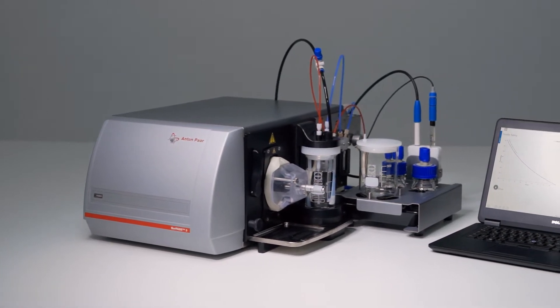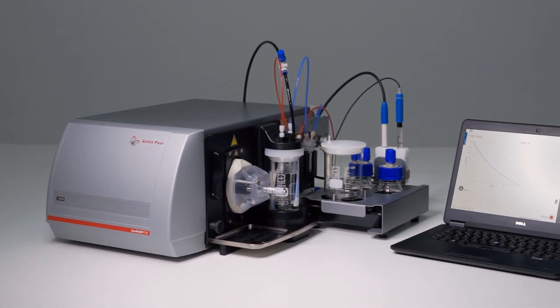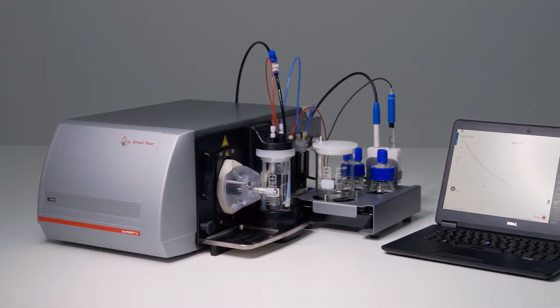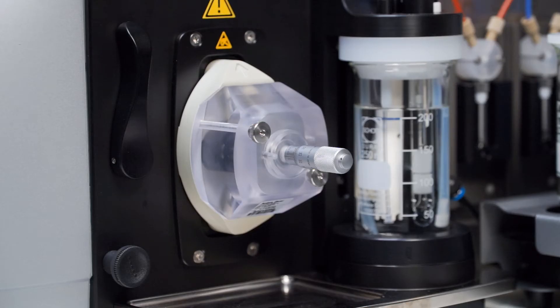This is the measuring cell for flexible tubings for the Surpass III Electrokinetic Analyzer. It's a measuring cell for mounting tubings with different diameters but also for polymer hollow fiber membranes.